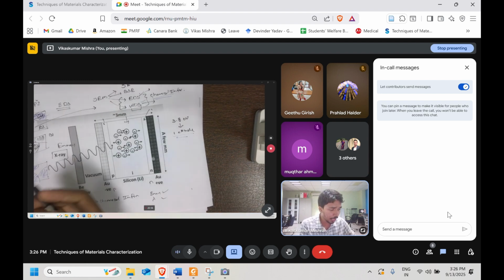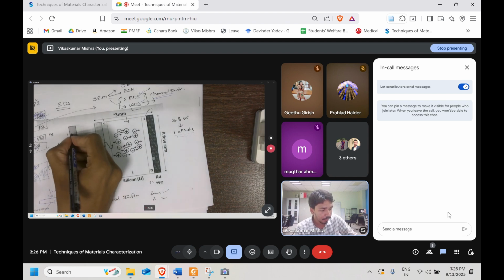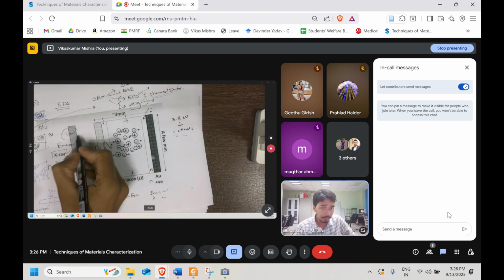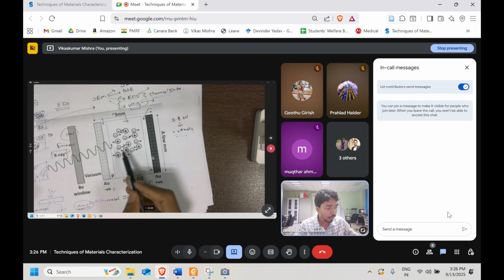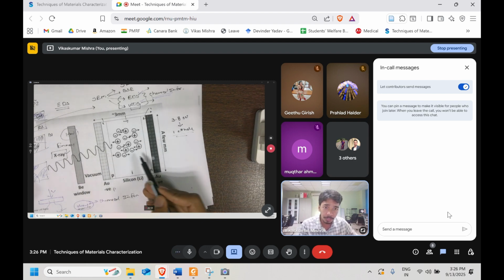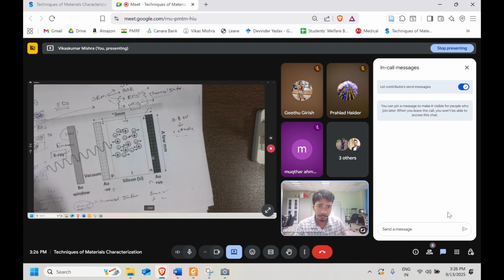So you have a certain amount of energy. The X-ray will be associated with a few keV. So depending upon which material it is, the specific characteristic energy that you are getting is going to generate the number of electron hole pairs. And the bias is applied across the P and N. So the holes will try to move toward one side and the electrons toward the opposite side.